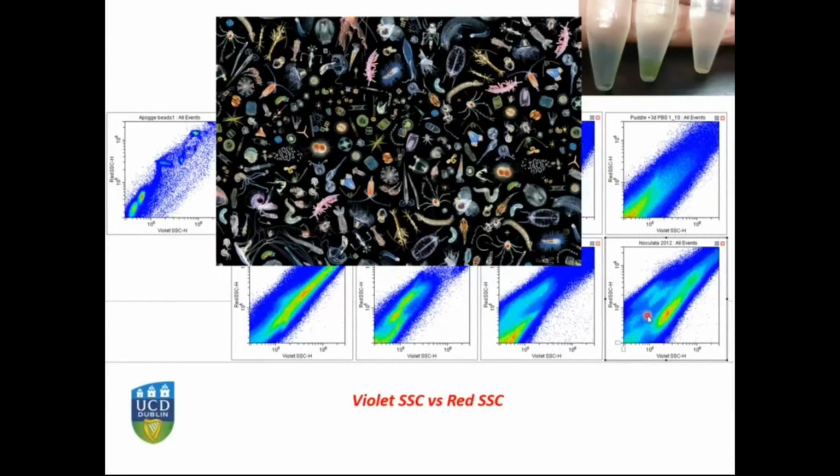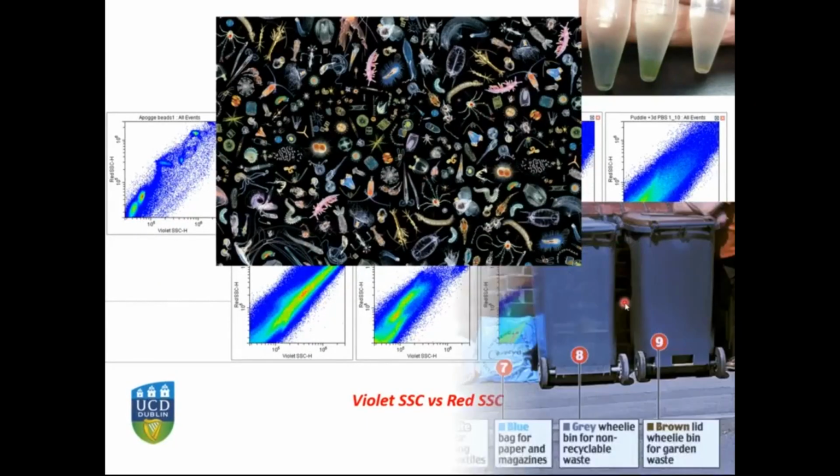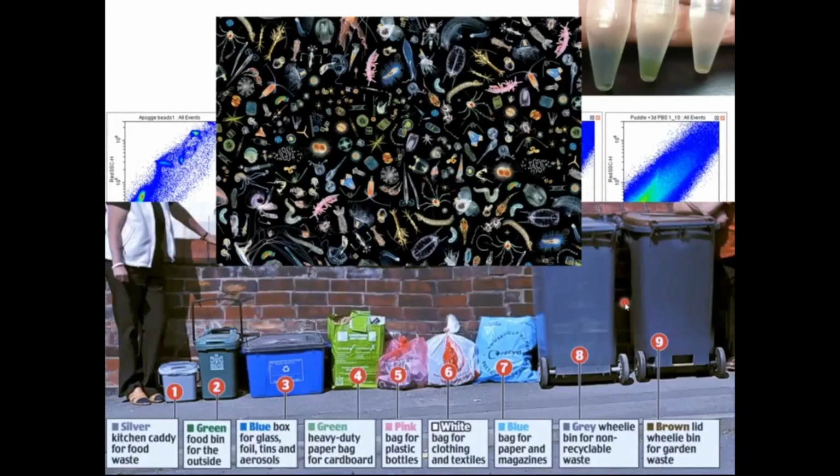And this is without considering that they also have autofluorescence. So the combination of scattering plus autofluorescence will help us to further distinguish and further characterize these subpopulations of phytoplankton or even zooplankton. Same thing, same concept can be applied to the extracellular vesicles.